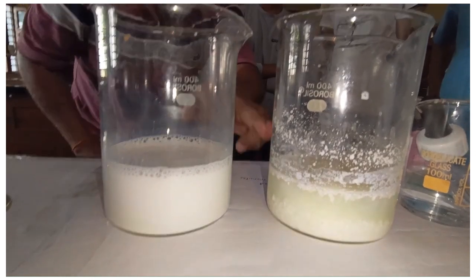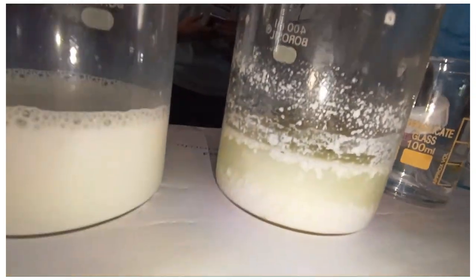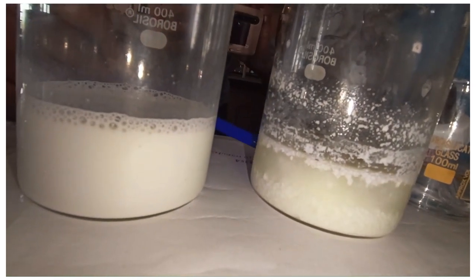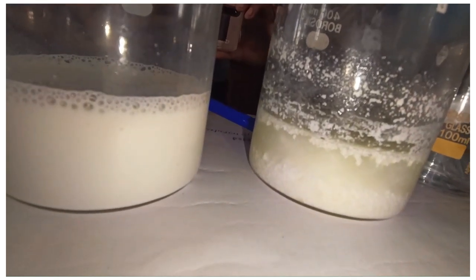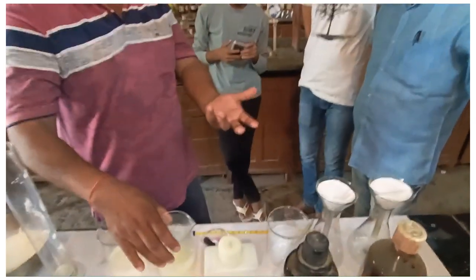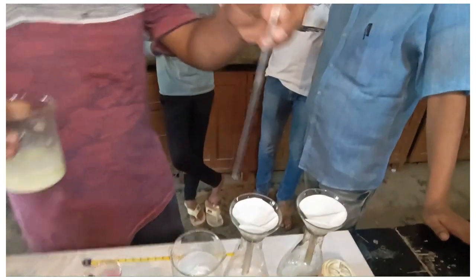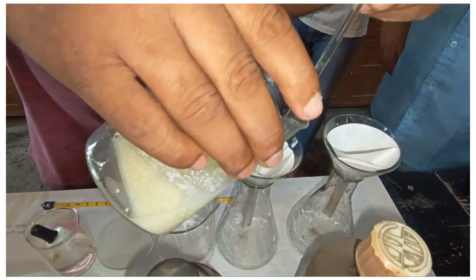You can see here the photo. You took the photo. This is the amount. Just collect this. This is the settled casein after 10 minutes. Okay, just click the photo, and after this, we separate it. We filter it. Now the filtration will be like this.